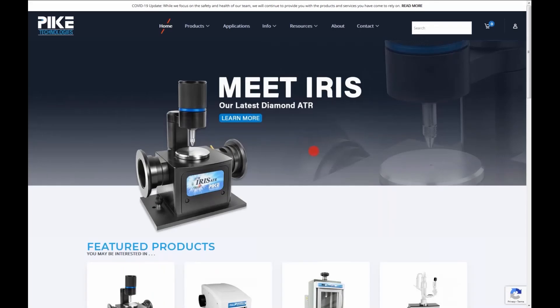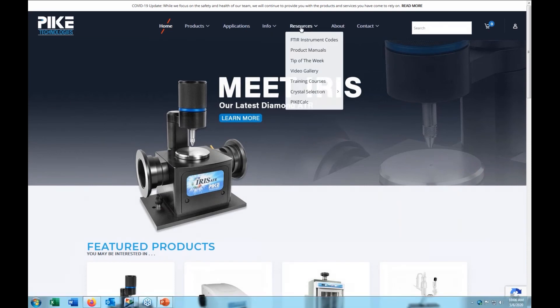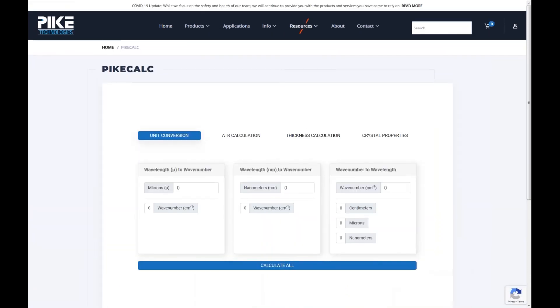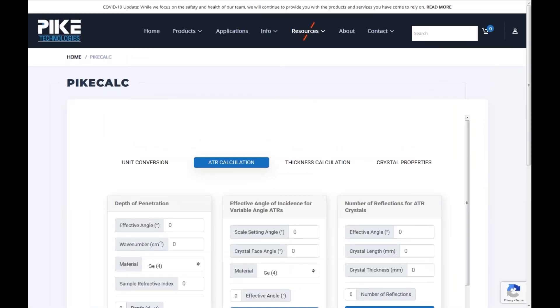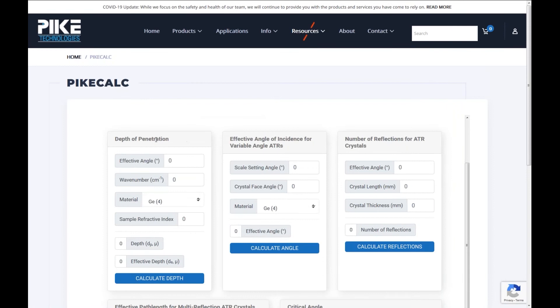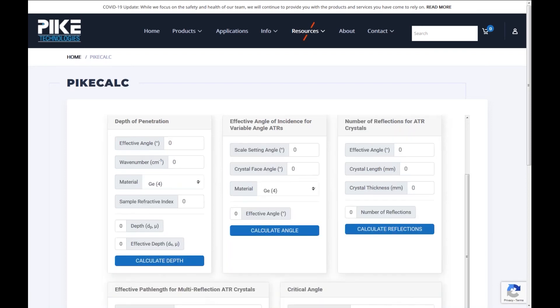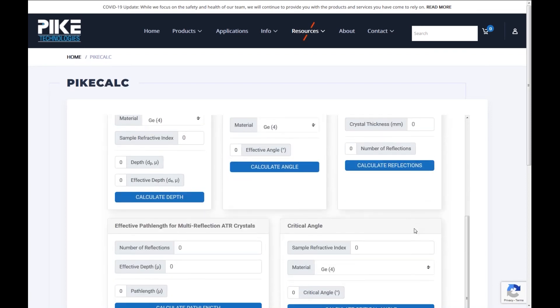Okay. So you can follow along on our website. If you are at our homepage, go to resources and then select Pike Calc. And we have several different tabs here. We're going to go to ATR calculations. I'm going to make this a little bit bigger so you can see a little better. Okay. Again, here's a list of everything we talked about at the beginning. And we're going to make pit stops at each one of these boxes. But first we're going to stop at the critical angle.